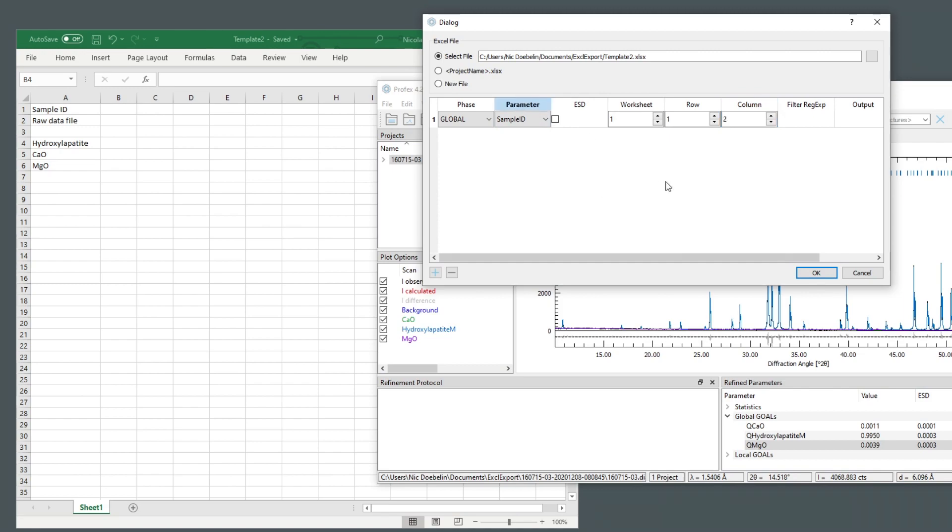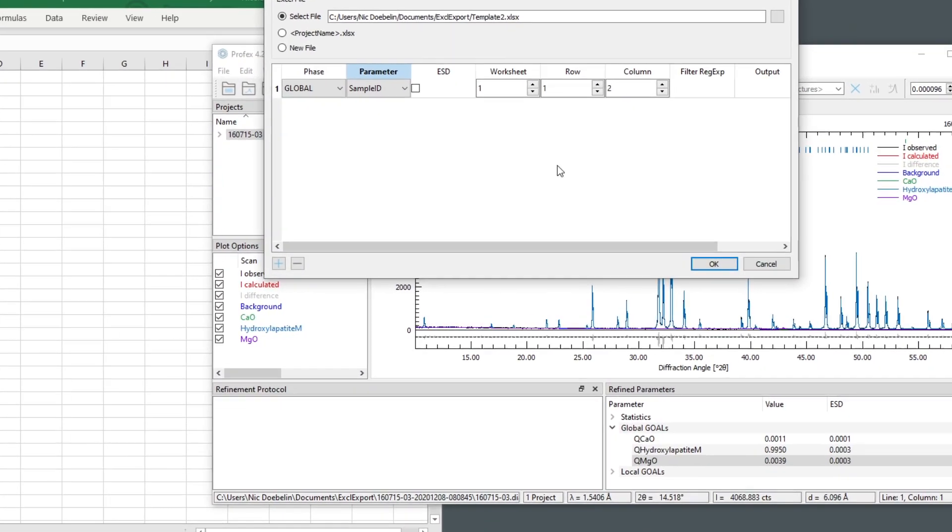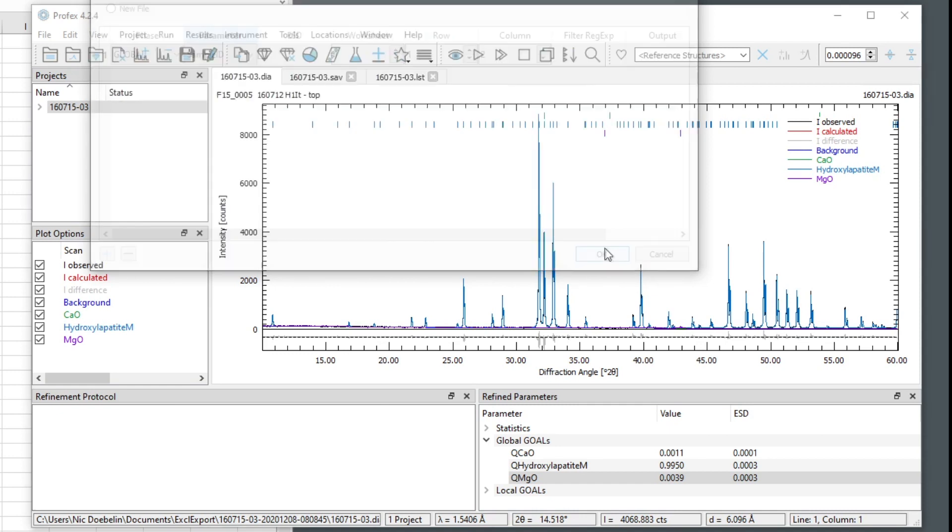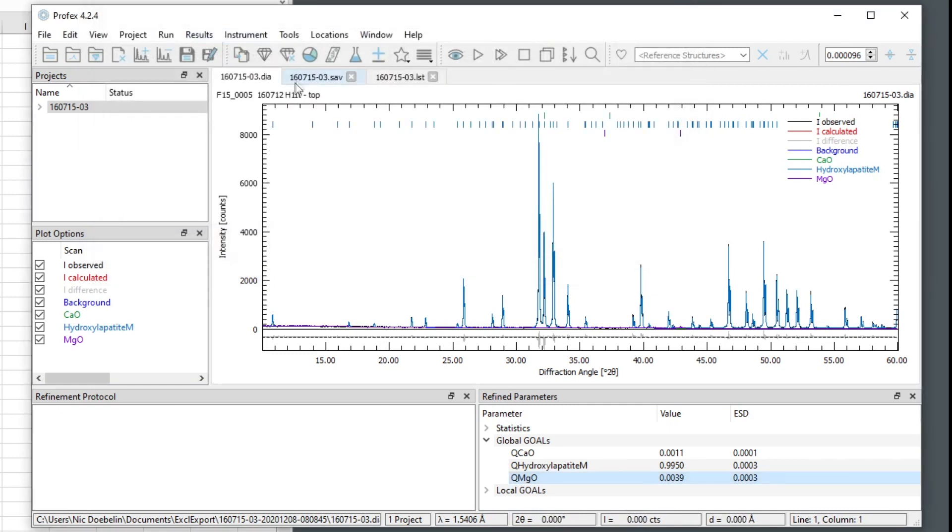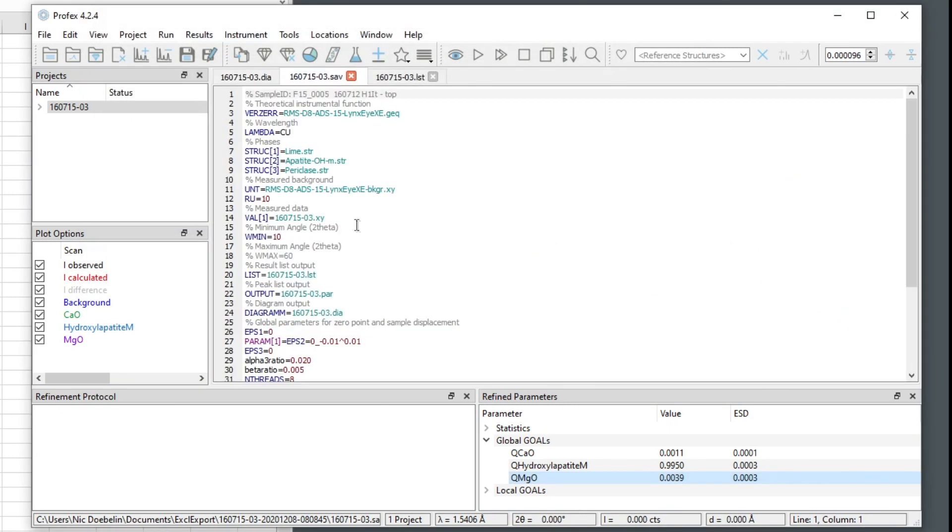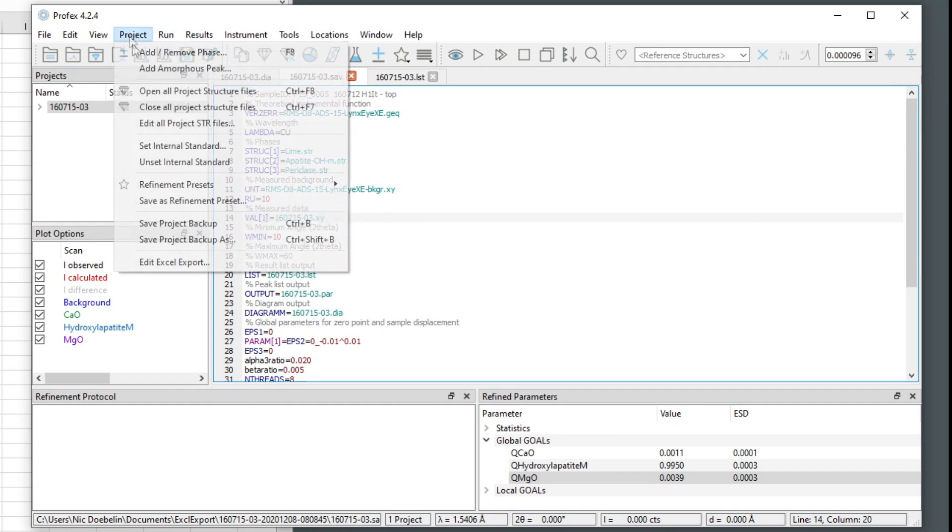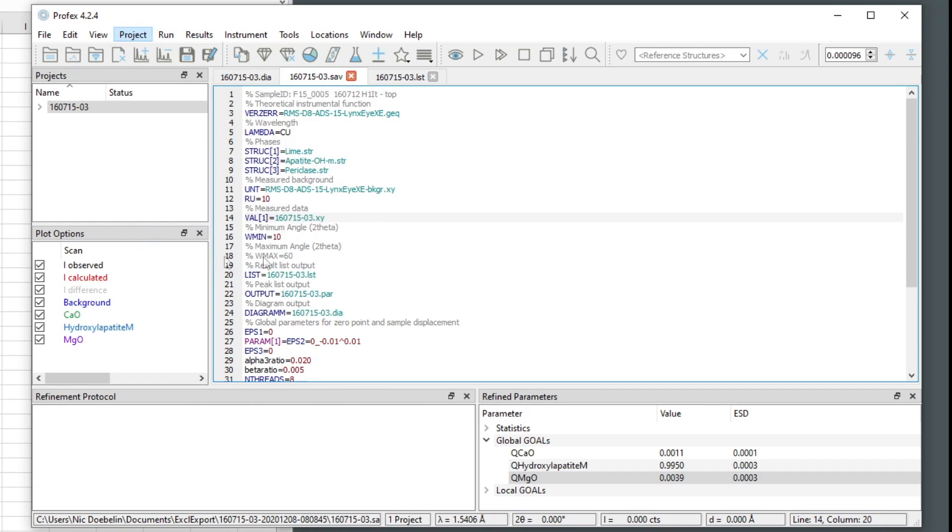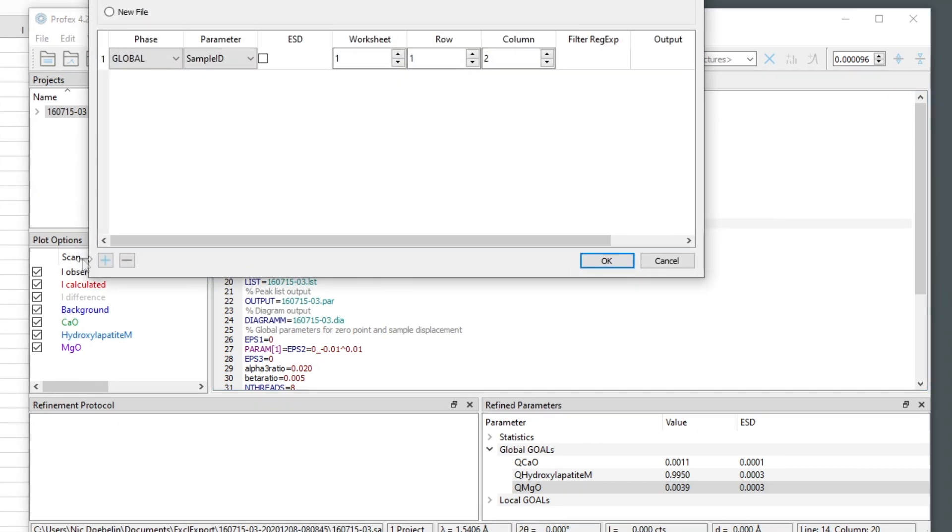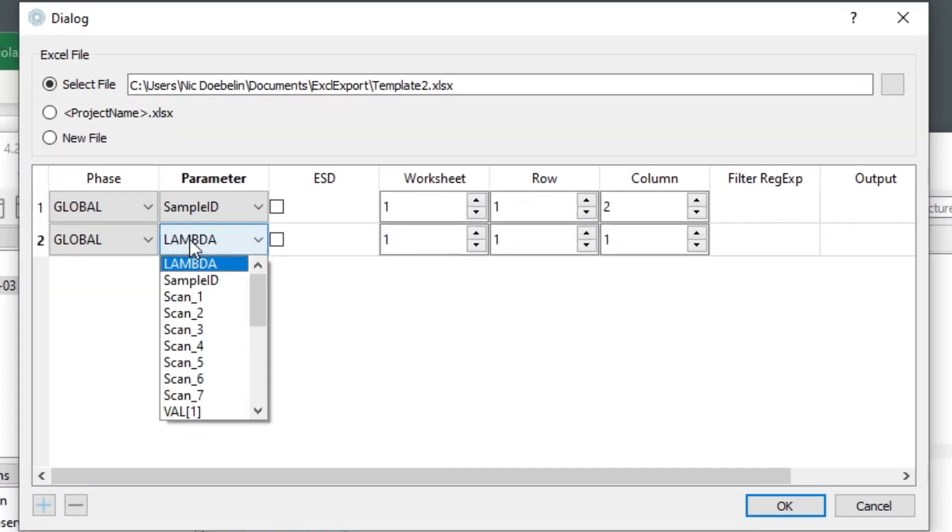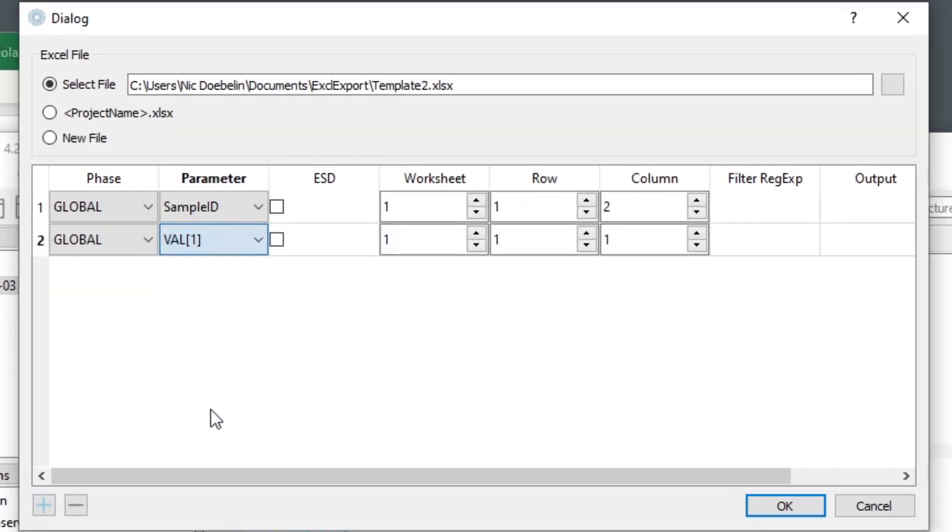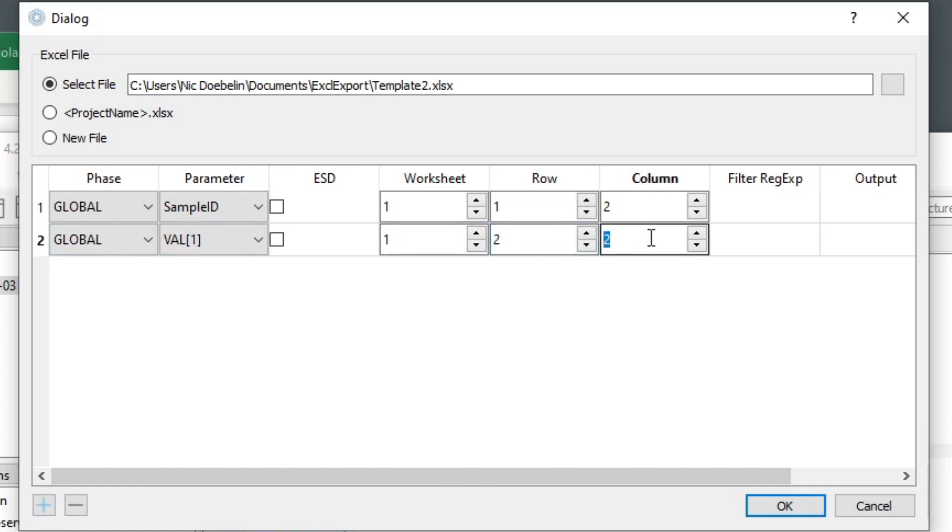Next, we want to export the raw data file. And let's have a look at the INP file. So what we want to export here is the measured data file name. So the value of the VAL number one parameter. So we select from the global parameters, the parameter VAL, which contains the XY data file name. And we want it to be written to cell B2. So that's row two, column two.